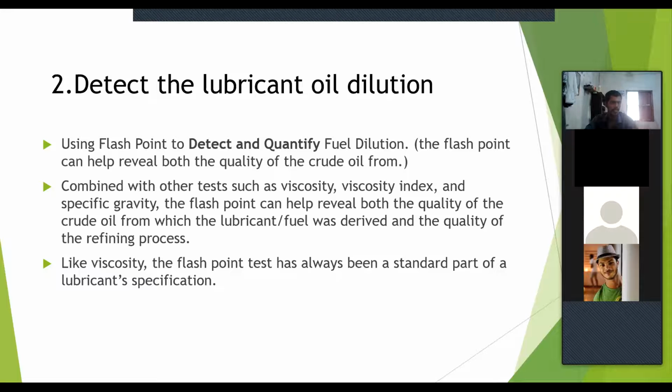And not only the flash point test, we are going to use different other tests also with the flash point test. The viscosity test also, we have viscosity index and viscosity. To measure the viscosity and the index, we have different apparatus, and that is a different test, right? So the flash point test can be combined with those viscosity tests and with the viscosity index test. I think you will have the practical about the viscosity test later, so don't worry about that. In this module, combined with those tests, the flash point test will be useful to find out the dilution and contamination.